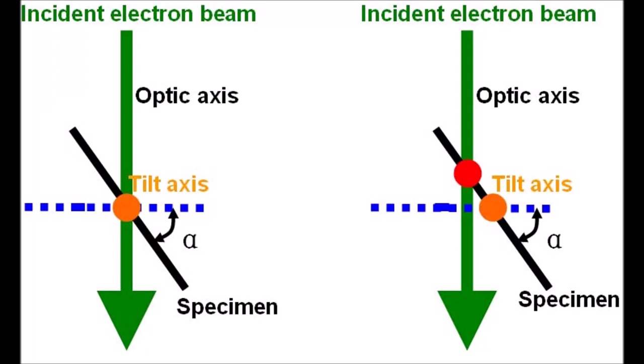Welcome back microscopists. I got a comment on another video about eucentric height and I thought it would be a good idea to cover the concept of eucentric height in its own video. We're going to specifically cover what is eucentric height, why it's important, and how to set it on your TEM. We'll demonstrate that using an FEI Tecnai, but the process is very similar for any brand of transmission electron microscope.